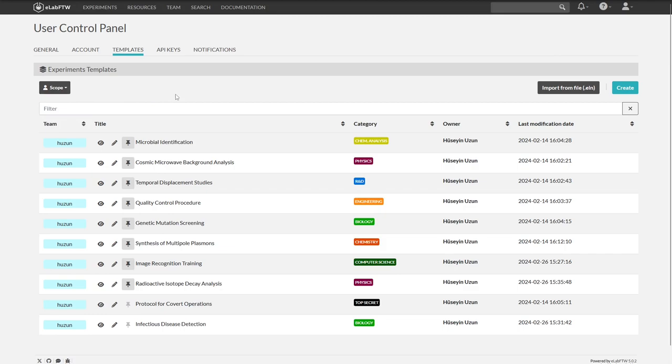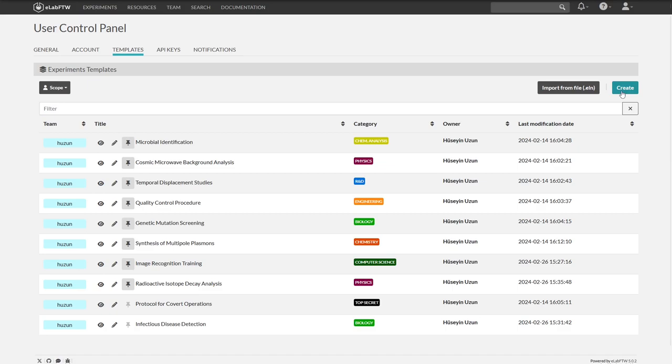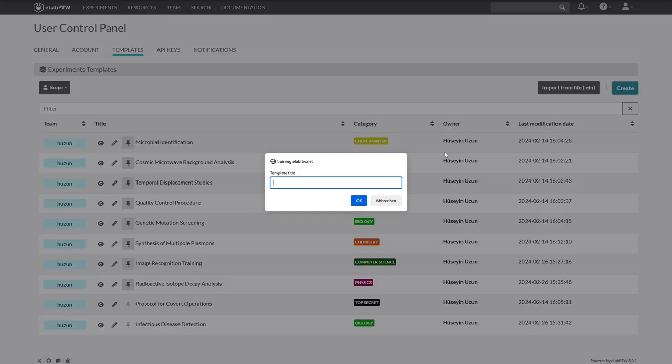You can view the existing templates, edit them or create new ones here. We will now create a new template and press create.